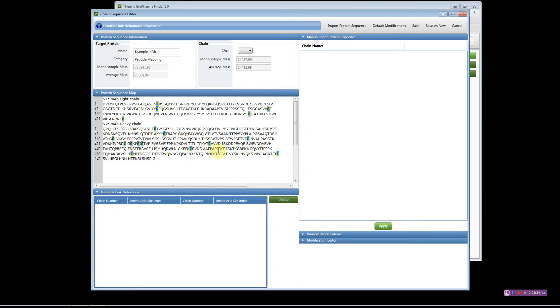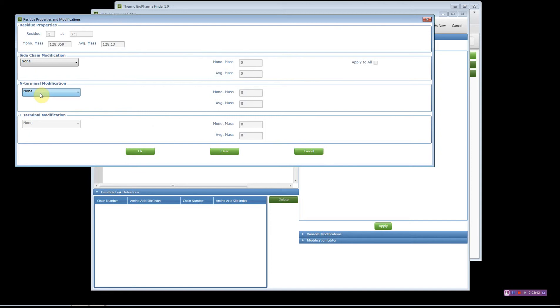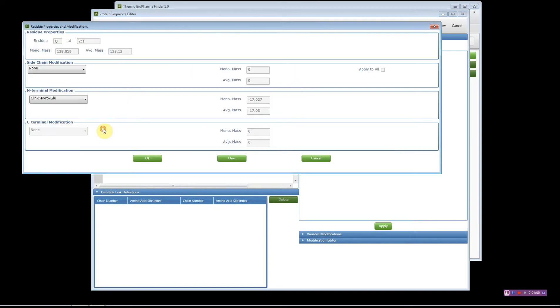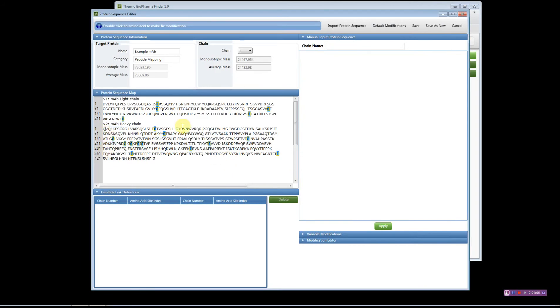I'm going to apply this to all cysteines I want modified, then click OK. You'll notice all the cysteines have turned because they're all statically modified and highlighted. To add an N-terminal modification, double-click there and the N-terminal modification option becomes available. To remove a static modification, double-click, hit Clear, and it's gone.